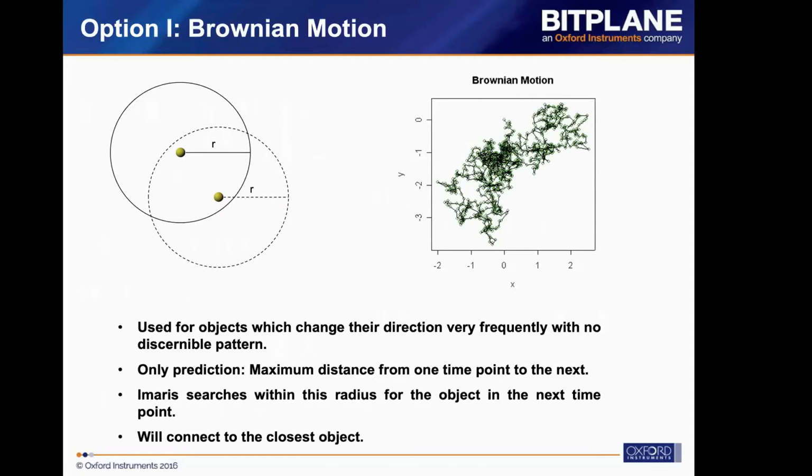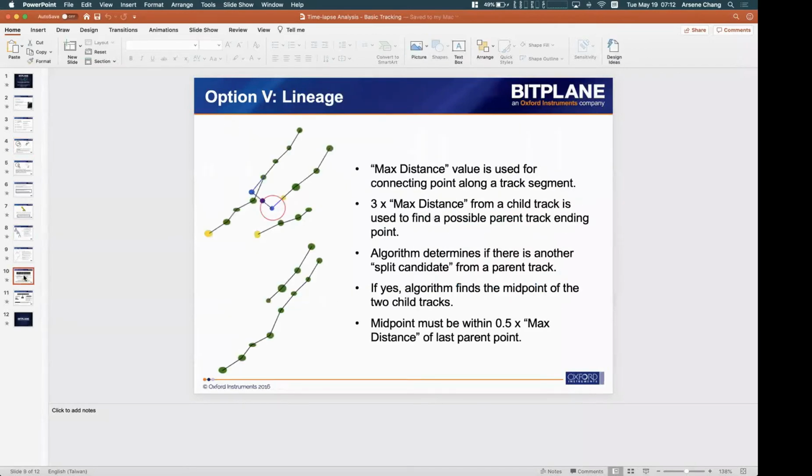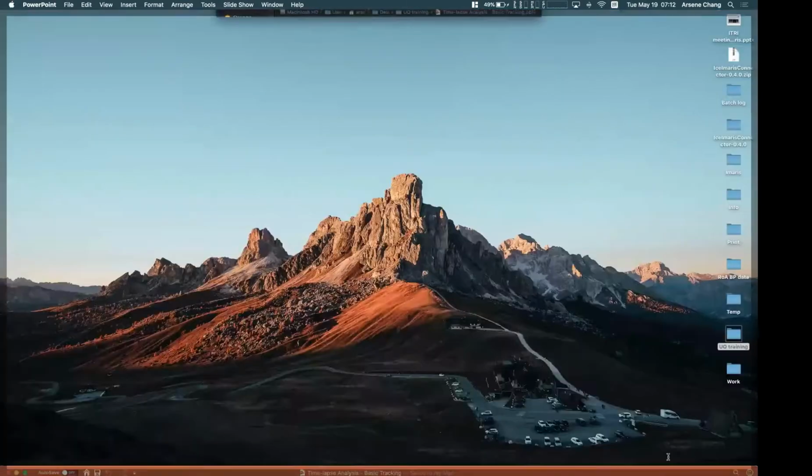So for the algorithms, I will just try to introduce them in my PowerPoint slides. Then we will go to Imaris for hands-on. In Imaris, I think we have a total of five different algorithms we can use for the tracking.